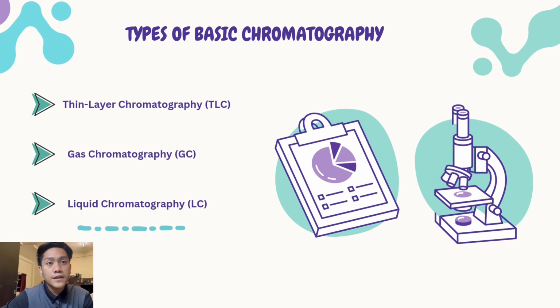For the next slide, types of basic chromatography. Here is a simplified explanation of the slide. Thin layer chromatography, or TLC, uses a thin layer of material like silica on glass or plastic and a liquid mobile phase to move the sample, separating its parts. For gas chromatography, or GC, the mobile phase is a gas and the sample is carried through a column and separates substances based on their boiling points or how they interact with the column.